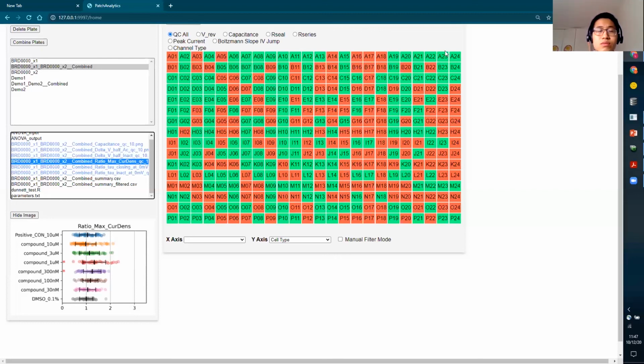I think I'm on mute, sorry. Another question that came in regarding the compounds that were tested on CAV 3.3. Did you test any compounds that were identified by Flipper which did not activate or block the current as you would have expected when tested on the SynchroPatch, i.e. did you have any false positives from the Flipper screen?